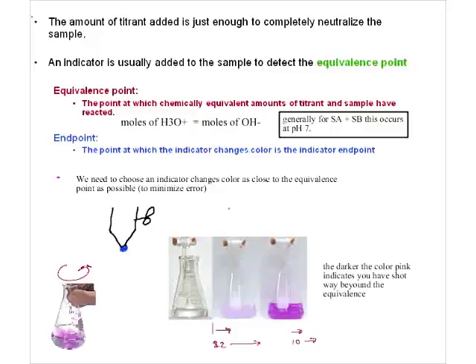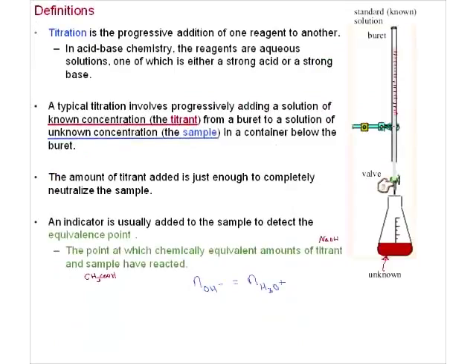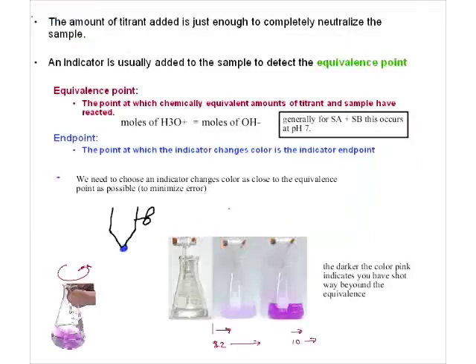Okay. In this experiment that we're doing here, we're going to be using phenolphthalein. And remember, phenolphthalein changes from colorless to pink at about 8.2. So as you're doing your titration experiment, let me just go back for a second. This is going to be our acid down here, which is going to be colorless to start. We're going to be adding some sodium hydroxide. And as we add it, we want to swirl and mix up the solution to make sure that everything is homogeneous and mixed perfectly.